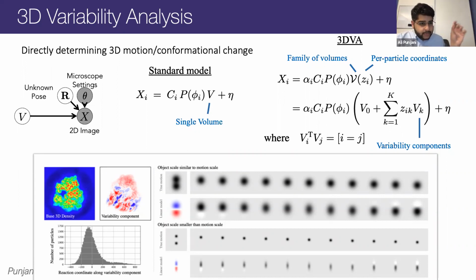If we want to see high resolution motion, then we can see that for proteins that we can resolve to a high resolution and they have small amounts of motion at that high resolution. And we'll see this naturally in the results that we get. But this is what 3D variability analysis does and how it represents motion and what it can do for us.